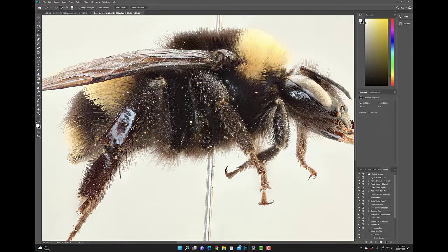So you want to overshoot the area by a tad, like as I've just done, and you also want to change the way that you select this. So what you can do is almost gradiate the edge so that as you make changes, it looks more subtle and a little bit more uniform. So in order to do that, you select Modify. You want to go to the border, and you can change the border. So let's just say you want to push it out by 10 pixels. You can do that and press OK.